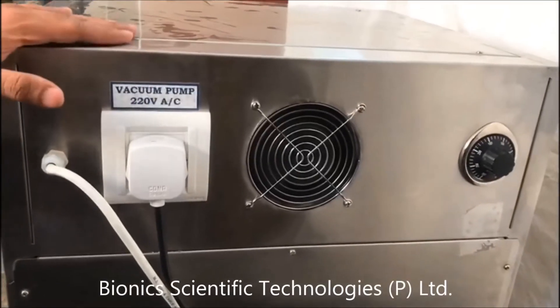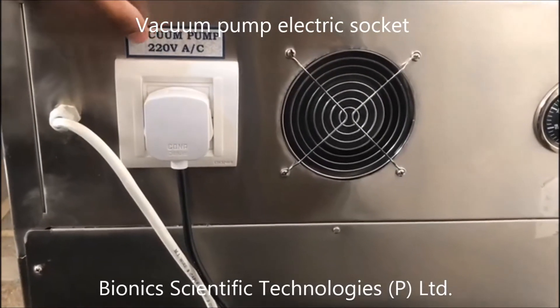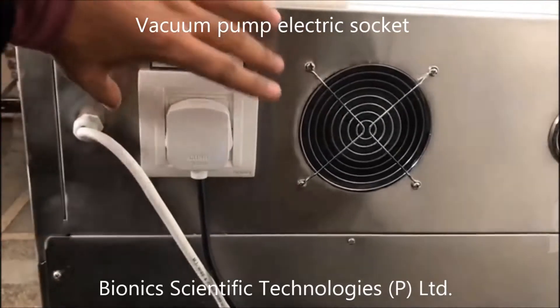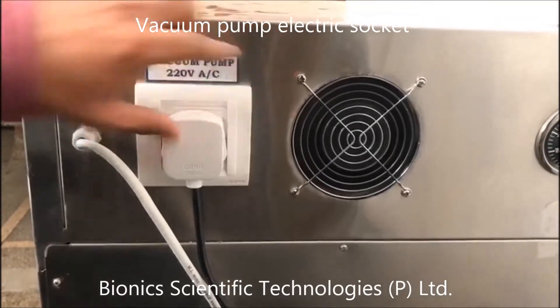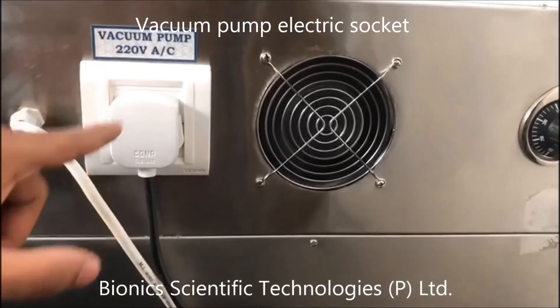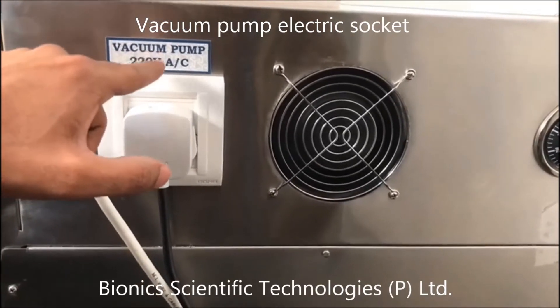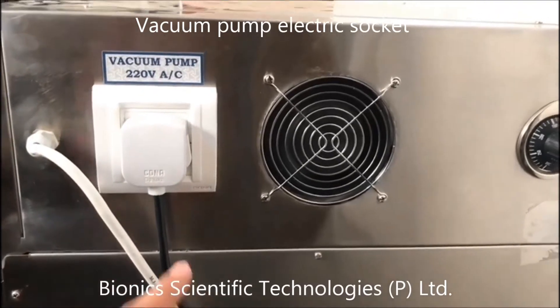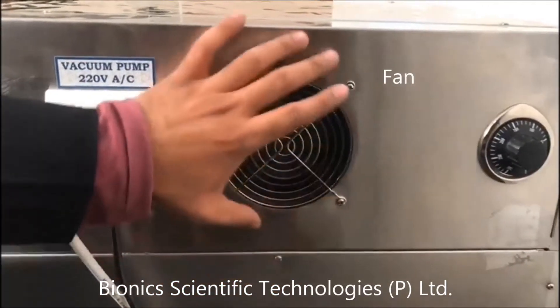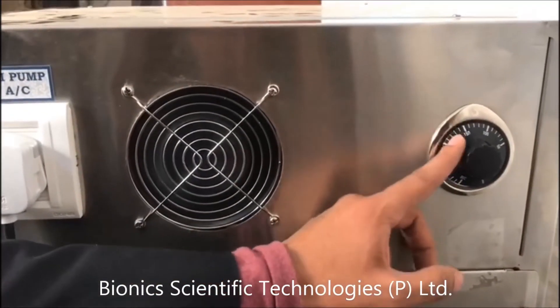This is the back side of the machine. As you can see, it is written here: vacuum pump. For the vacuum pump there is a socket available which gives sufficient electrical supply — that is 220 volt. And this is the fan, and this is the safety thermostat.